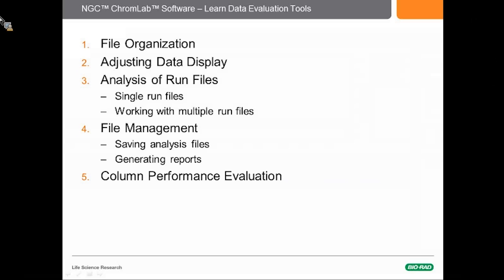Okay, now at this point, we've covered the available tools in the ChromLab software that will help you in your analysis and the visual presentation of your data. We've reviewed the run file organization, the information on adjusting the data display, and how to analyze the run files. We've also talked about saving the analysis and generating reports.